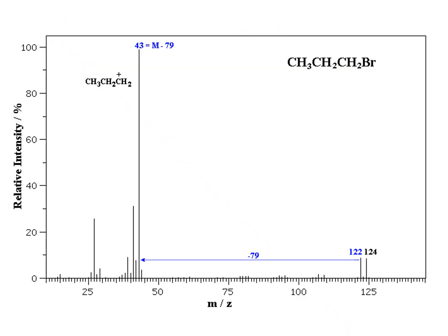One of the things that we also consider when we look at our mass spectrum, and the reason that it is so good for determining structure, is because we are essentially putting a puzzle together. When we fragment, we are breaking the molecule up. If you've ever built a puzzle, you know that there are different pieces that will fit just right to another piece that will connect to another piece to create the biggest picture, and you then get to see the whole.